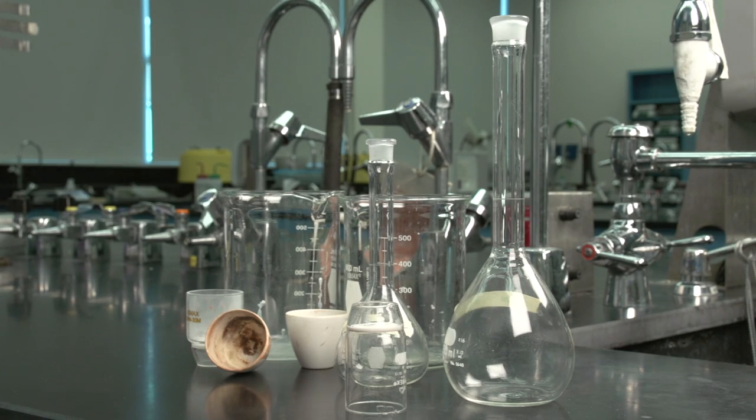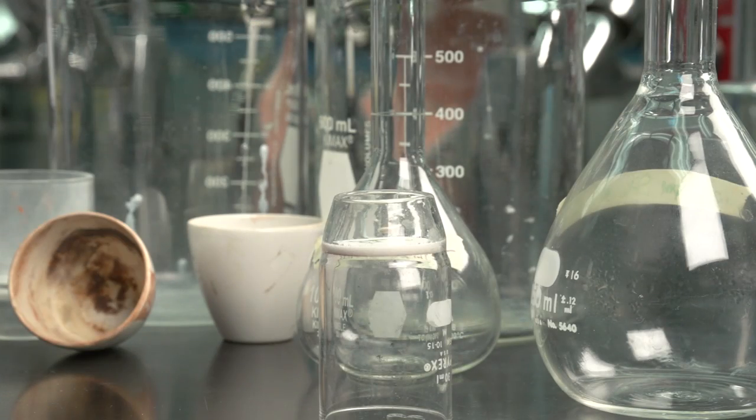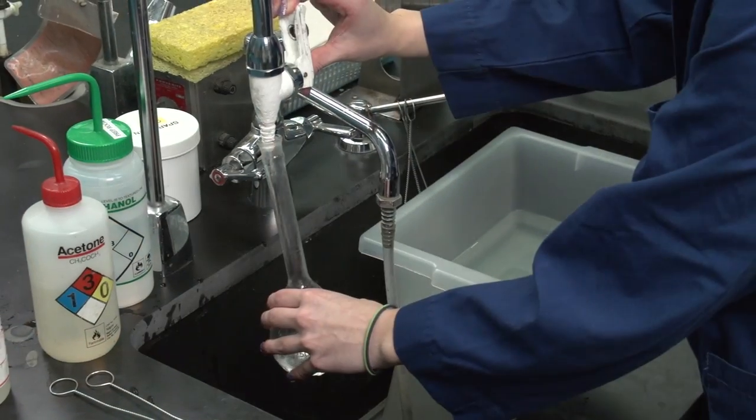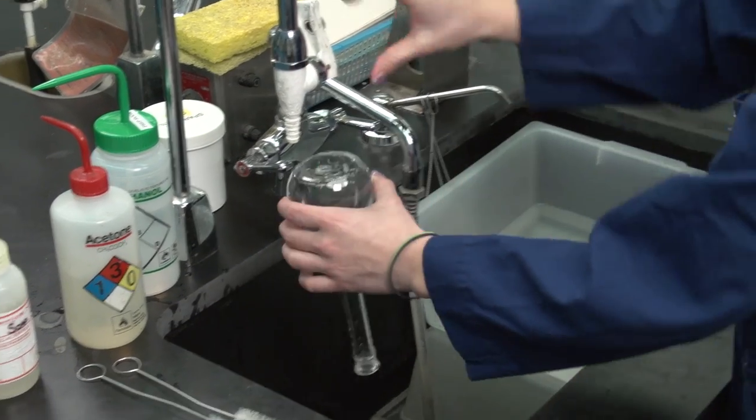Dirty glassware is one of the leading causes of experimental errors. Often glassware appears to be clean, however it may be chemically dirty. Traces of ions, soluble substances, or different solvents cause errors that can be prevented with some extra effort during washing and rinsing.